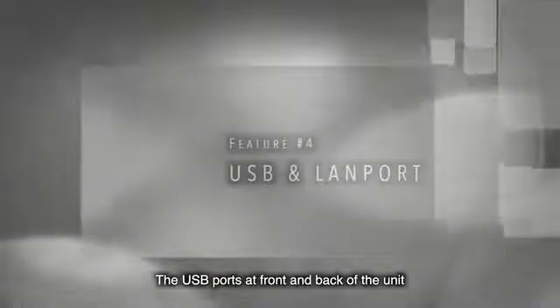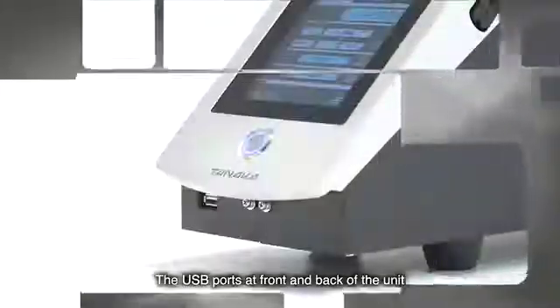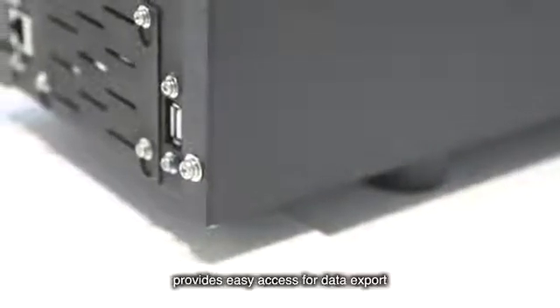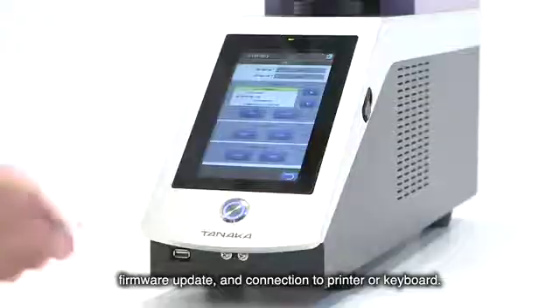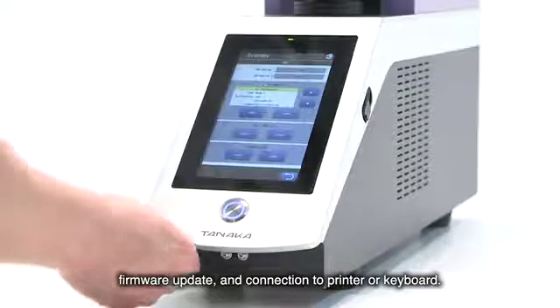The USB ports at front and back of the unit provides easy access for data export, firmware update, and connection to printer or keyboard.